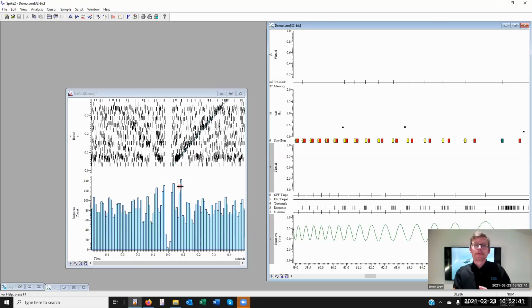I've used the result view like this just to set everything up for me, and I then grab the information through the script and put it out to a text file. Okay, I hope that helps you there. All right, I see that Marika has helped with that one.